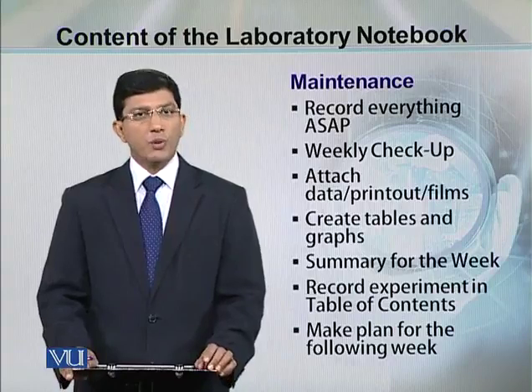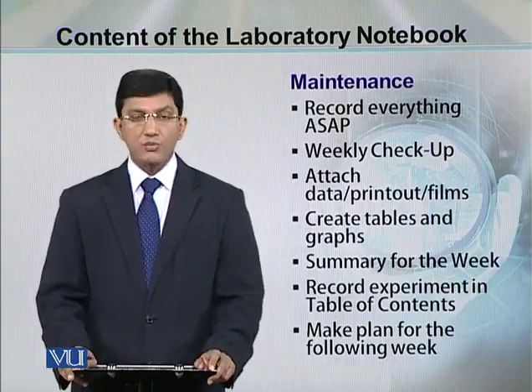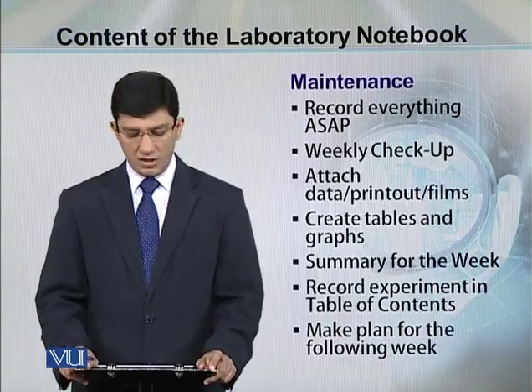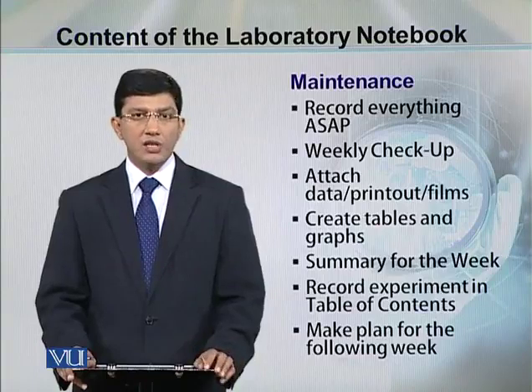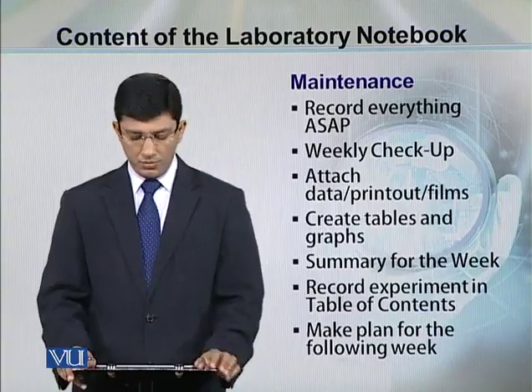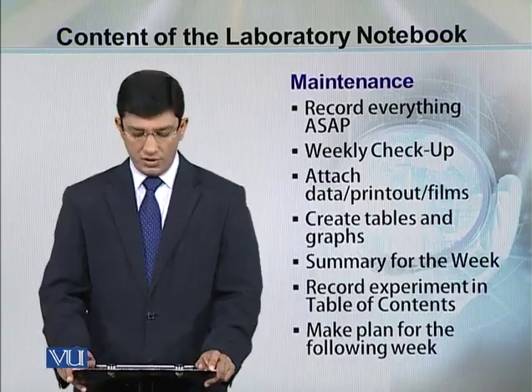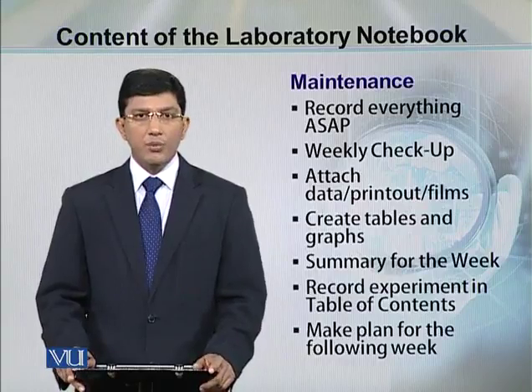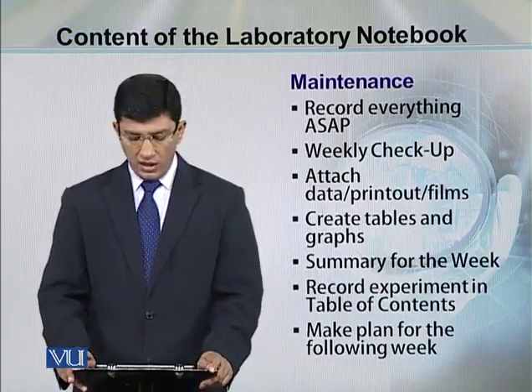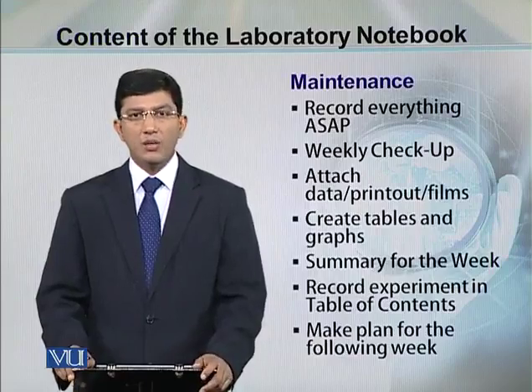The notebook should be properly maintained. Record everything as soon as possible. It should be checked weekly to see if something is missing. Attach any printout immediately when you get it from the printer. Create the tables and graphs instantly. Summarize the weekly work, plan for the next week, and record or list your experiment in the table of contents.